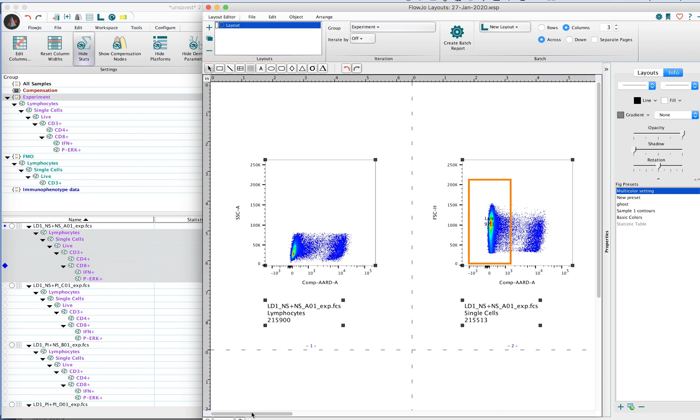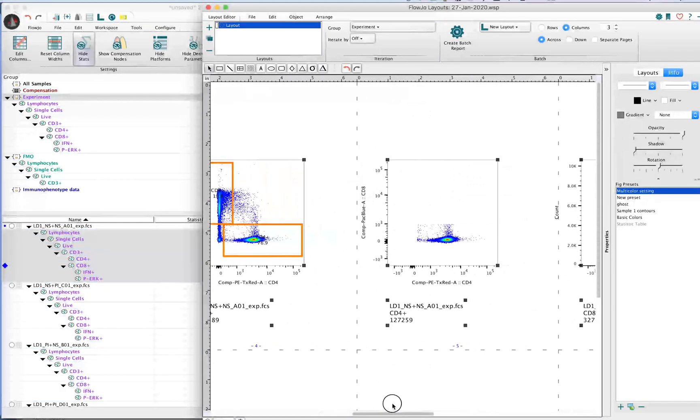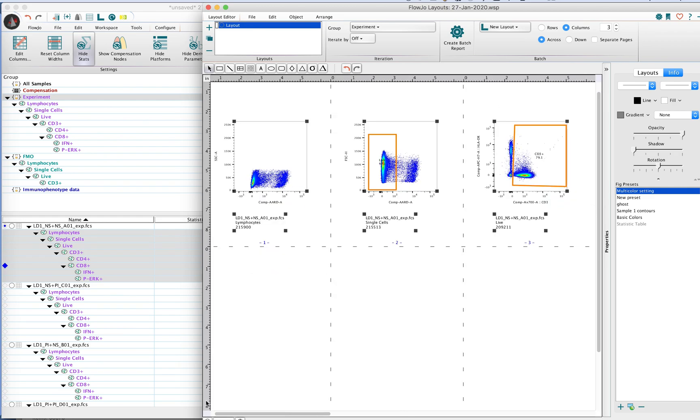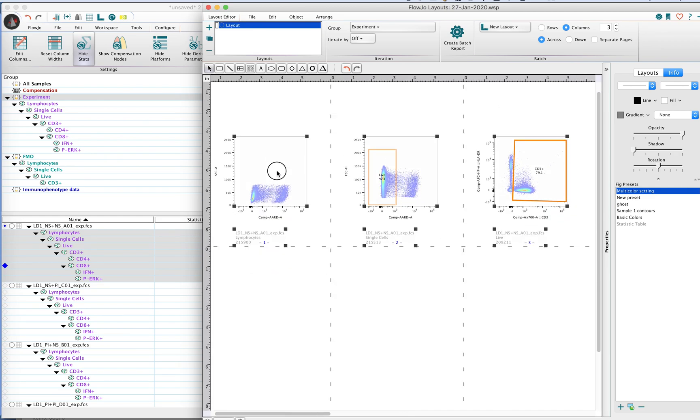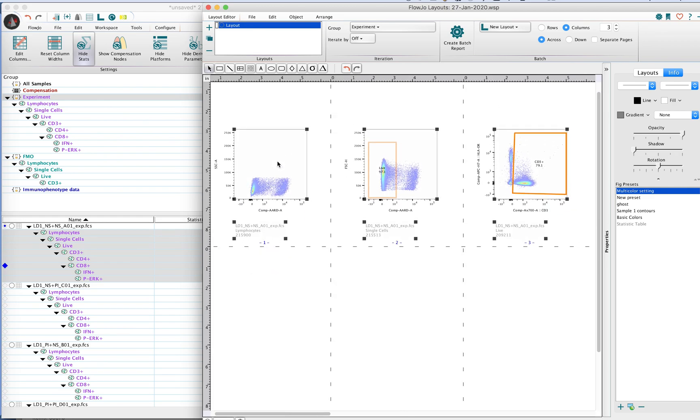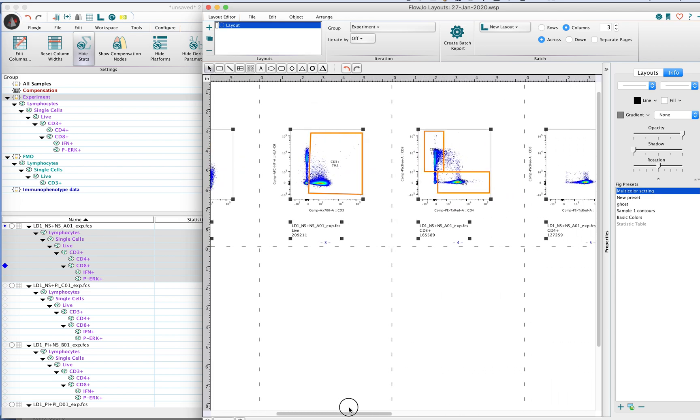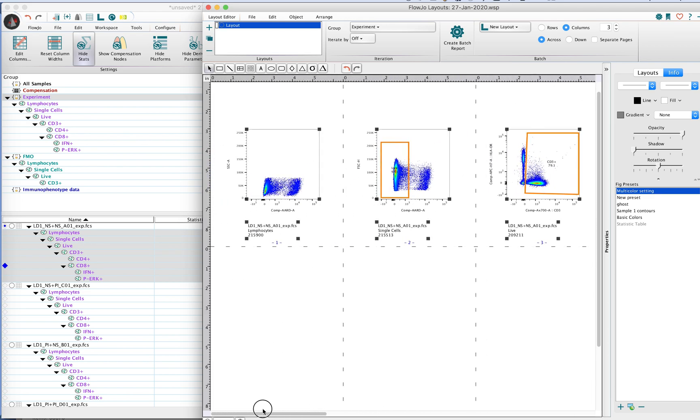When they initially come into the layout editor, they will all be aligned such that everything is correctly aligned vertically and spaced evenly.